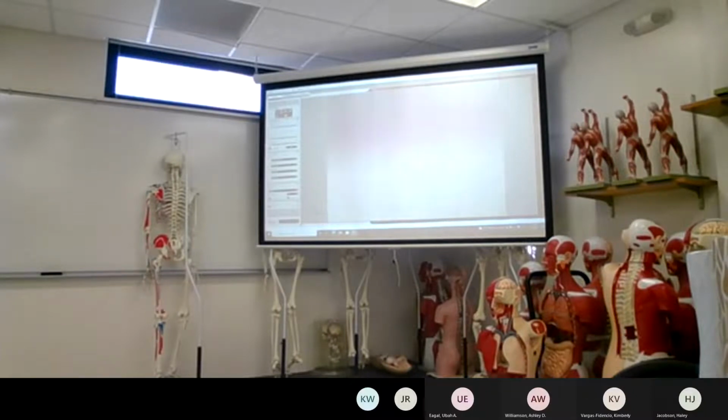All right, number 10 is cartilage. Our 10 is broken. Oh, that's okay. Okay. Fine. If it's broken, but it's not broken on the part where the tissue is, you might be able to still put it on the stage and look at it.